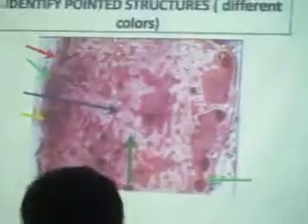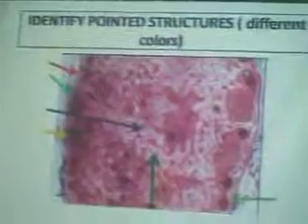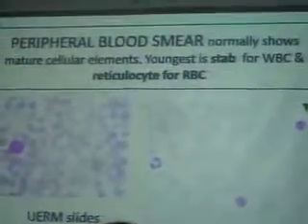Identify A. B. Hindi, ang layo eh. The pulp is on this area. Just around peri-arterial. That's the marginal zone. Marginal. Okay, identify. Oh, tinanggal. Yung red. Yung green. The light green. The dark blue. Cord. Medullary cord. Okay, the yellow. Lymphoid nodule.